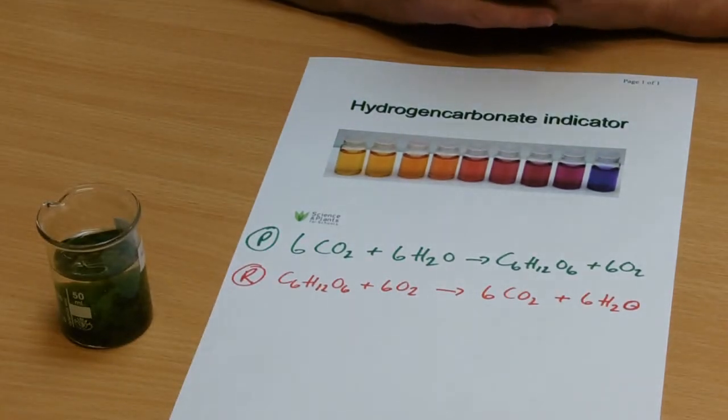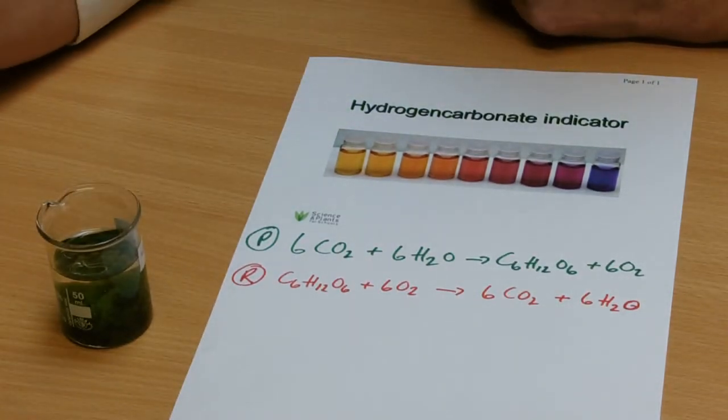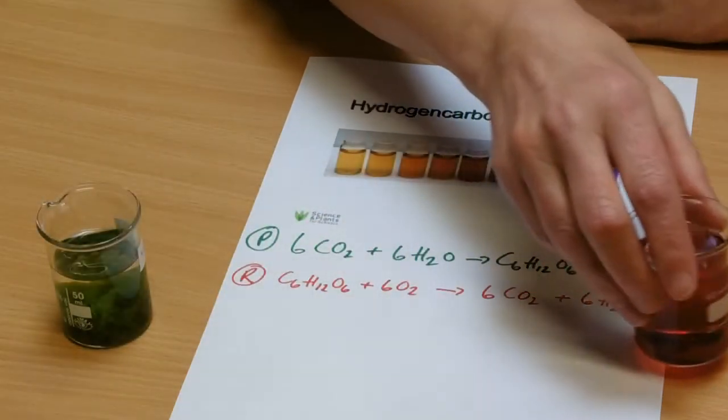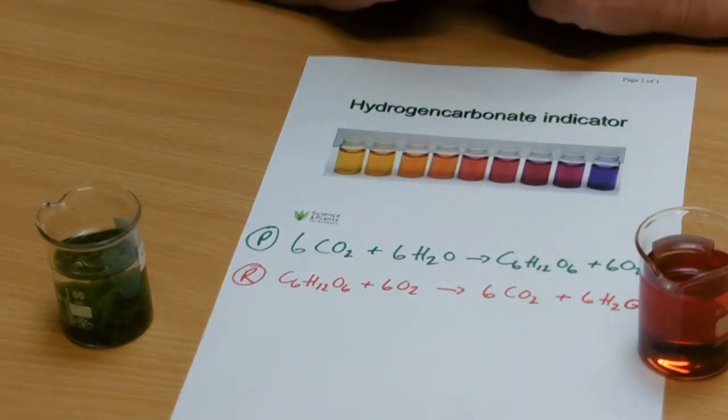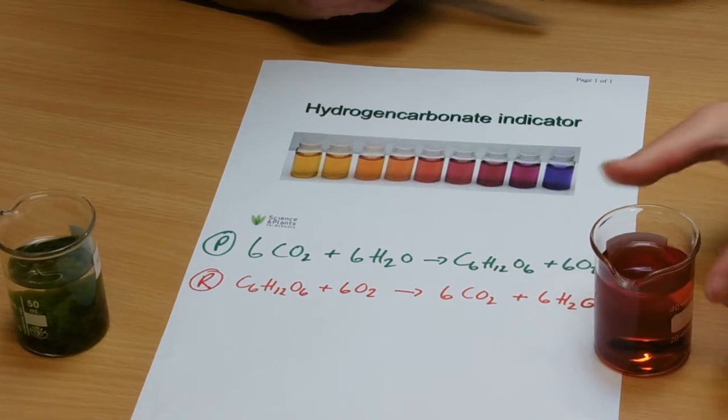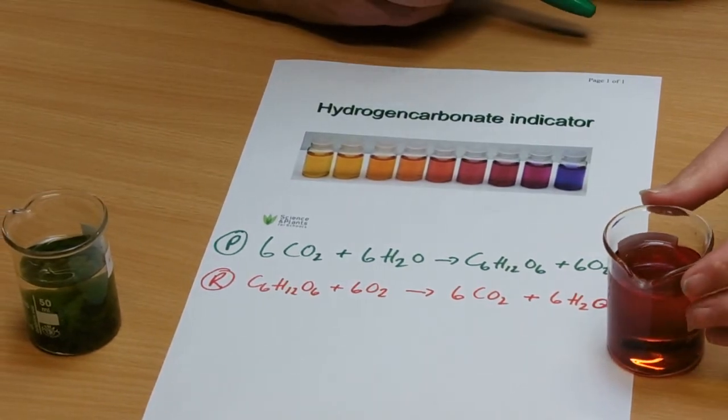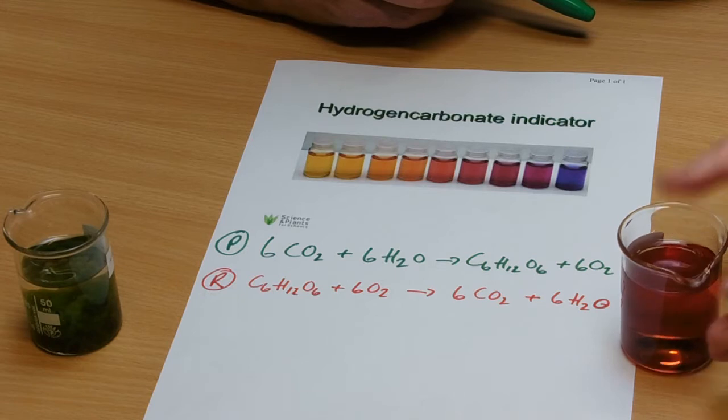OK, so the experiment that we're doing is we're going to use an indicator called a hydrogencarbonate indicator. And you can see that this is a lovely red color. It actually is an indicator of pH.